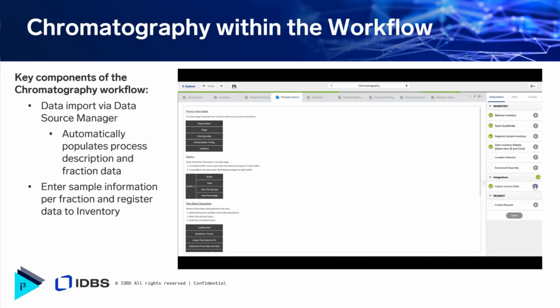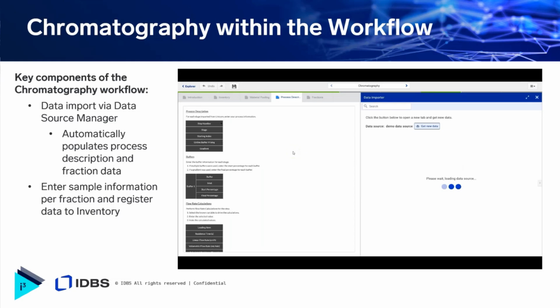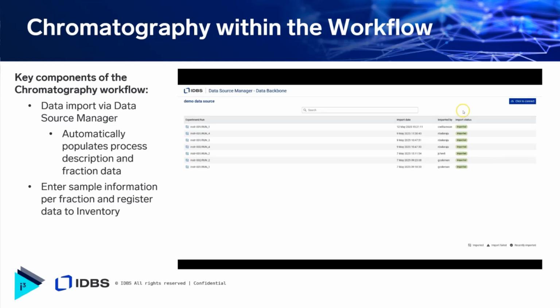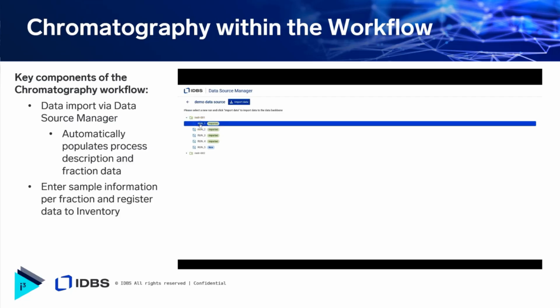So in this video, we're going to open up the data importer, which is a tool similar to Inventory Quick Finder within the web editor. Then this will open up the data source manager. This is a new end user interface tool that is used for both administrative purposes of connecting to the integration, and it also allows users to actually add and select this data.